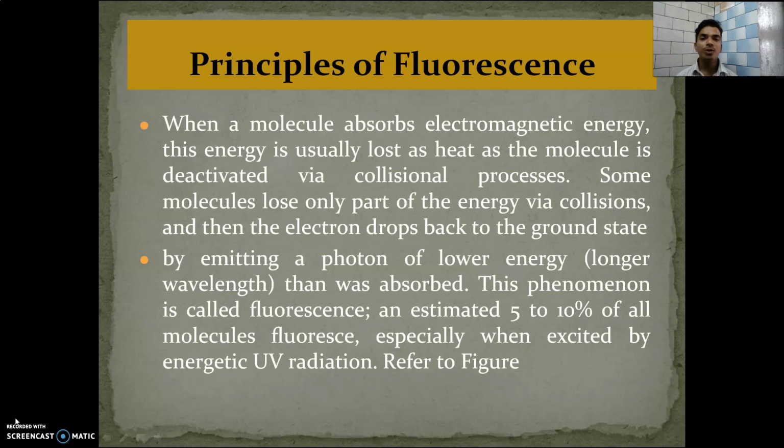So this phenomenon is called fluorescence, that is, emitting a photon of lower energy than was absorbed is called fluorescence. And 5 to 10% of all molecules fluoresce, especially when excited by energetic UV radiation. So we refer to a figure to understand this principle.